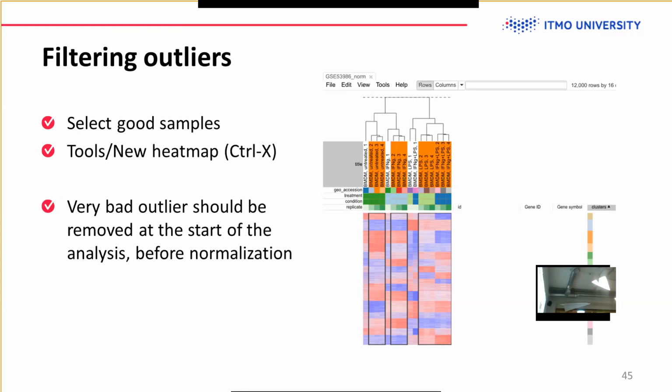At this point, we can tell, okay, all 4 samples look like outliers. Let's remove them from our further analysis. However, sometimes it's not that easy. Sometimes it is easy: you have a really nice data set, but one sample is really different from any other, and you can usually say that this is an outlier. But sometimes it's not that definite. So is it an outlier or not?